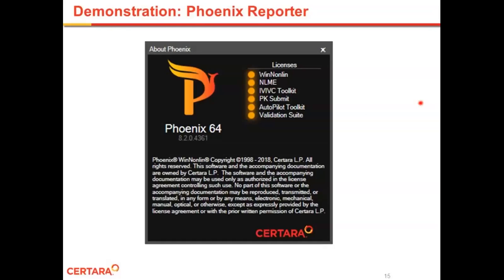Hey, Chris. Yeah, it does look like we have some questions. Someone was asking about the reporter, and they wanted to know, with the plots, they wanted to know, can you do linear on top and log below instead of side by side?